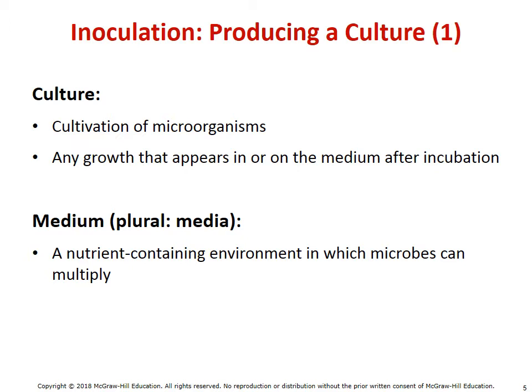The idea behind inoculation is to ultimately, potentially, produce a pure culture. But we should probably define what culture is. Culture is the purposeful growth of microorganisms, also known as cultivation. Really, any growth that appears in or on a medium after incubation would be considered to be part of the culture. So again, growing microbes on a medium is culturing.